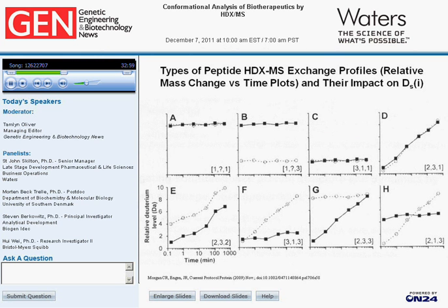So summing these numbers just reinforces themselves, whereas when you have no difference, such as A, C, and D, by summing the numbers, you basically get a very small number because there's a cancellation of the pluses and minuses. Where you're going to run into some problems, and this corresponds to that second type of difference number. Next slide.